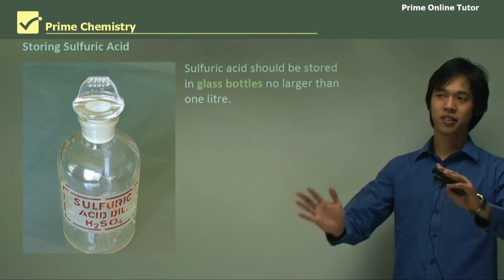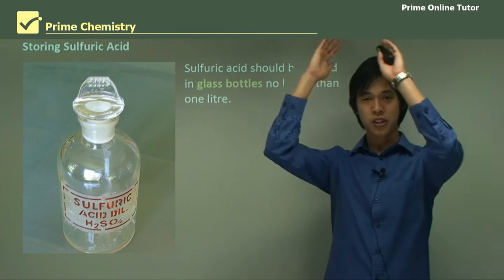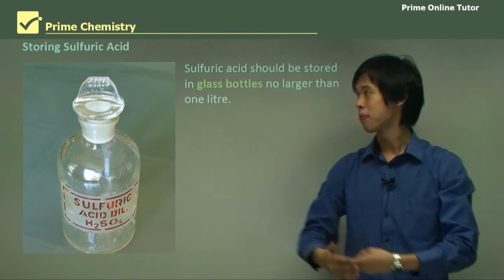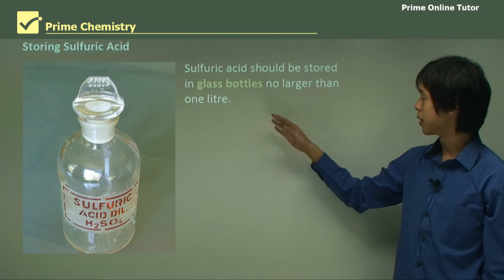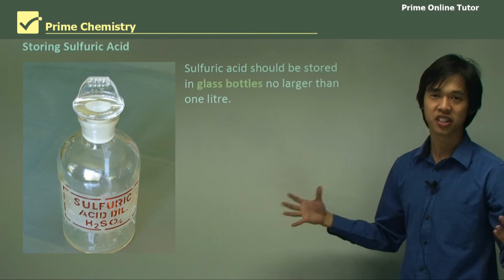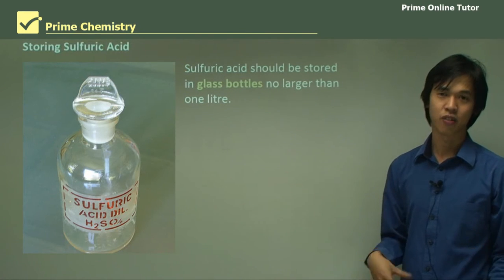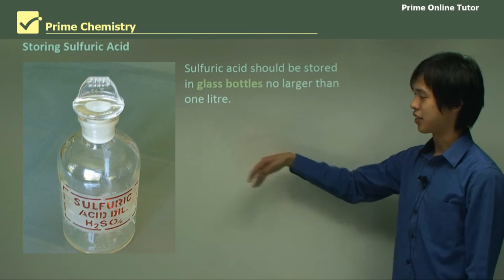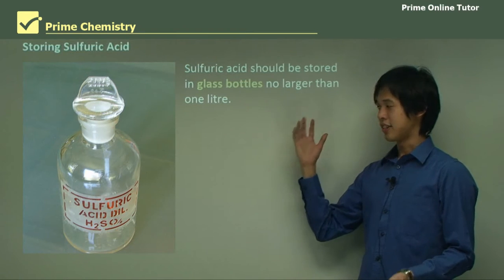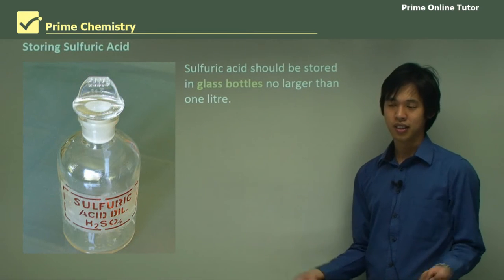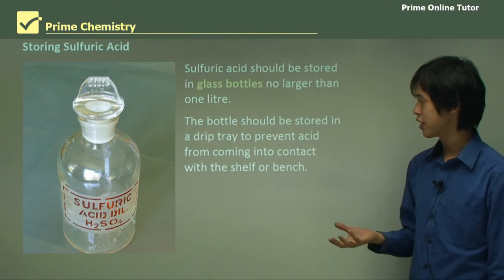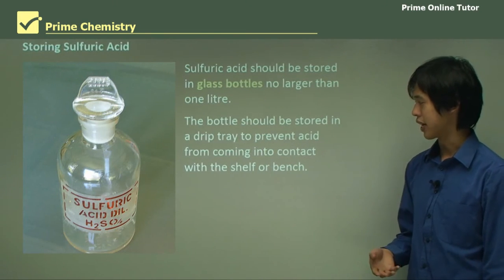Now, how do we store sulfuric acid? Sulfuric acid can be stored in glass bottles, and definitely no larger than one litre. You don't want a huge container of sulfuric acid just sitting around, because that's a recipe for disaster. Glass bottles are very safe — glass is a strong substance — and no bigger than a litre. The bottle should also be stored in a drip tray to prevent acid from coming into contact with the shelf or bench.